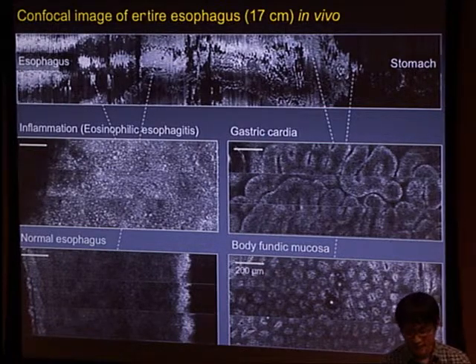All right. So going back to the finding Waldo challenge. Now we have a technology where we can visualize this whole picture with all the details. Still, the challenge might be that it's not all that straightforward to find this Waldo guy or any sort of pattern that we are interested in. So one thing that we can potentially do moving on is to highlight some of the features so that you can easily identify this guy over here. Okay. So this is what I used to do back in Massachusetts, and I will probably continue working on this with other advanced forms of technology.